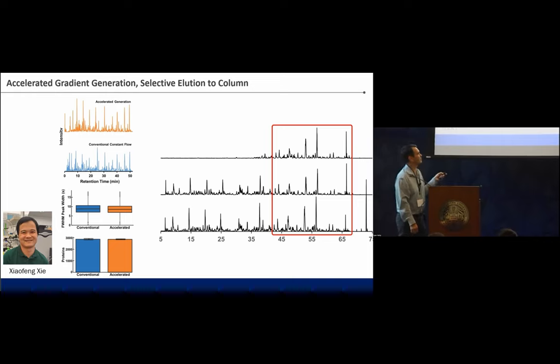Yeah, I don't know that we have. So it's published, right? It's in Analytical Chemistry, but it was with a student that was leaving. So we kind of took what we had, and there is more to do there, right? Because there's a clear trade-off. We're identifying the proteins in more cells per unit time, but not necessarily more spectra, right? And so there's more work to do.